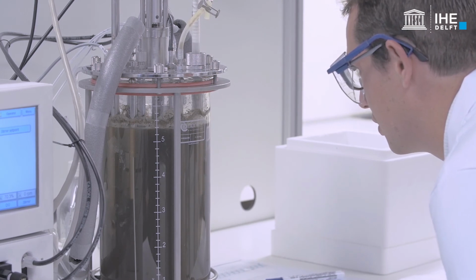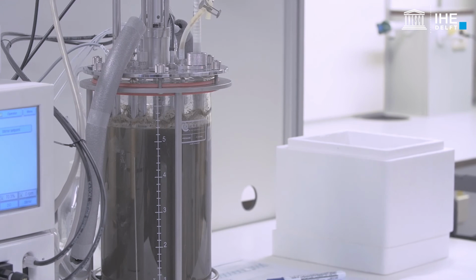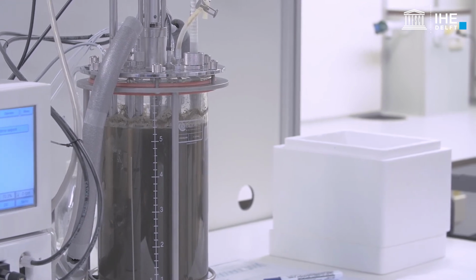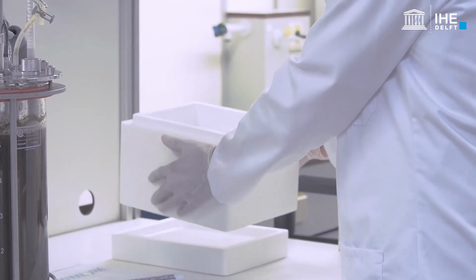If possible, carry out the analytical determination of the parameters of interest immediately. Otherwise, follow the required procedures for the preservation of the samples until they are analysed.